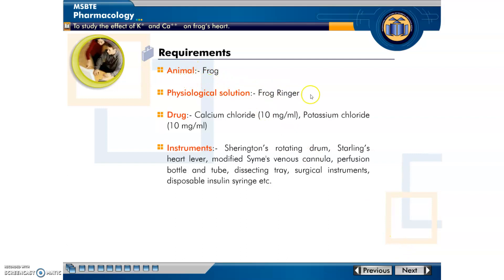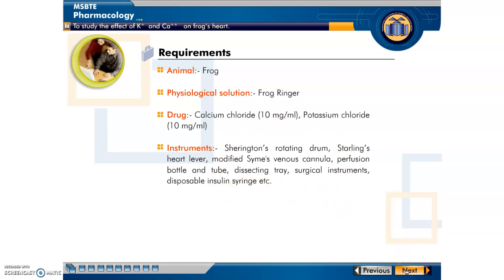These are the requirements. The animal used is a frog, and the physiological solution used is frog Ringer's solution. The drugs used for this experiment are calcium chloride and potassium chloride, each at a concentration of 10 mg per ml. These are the specific instruments used to study the effect of calcium and potassium ions on the heart.